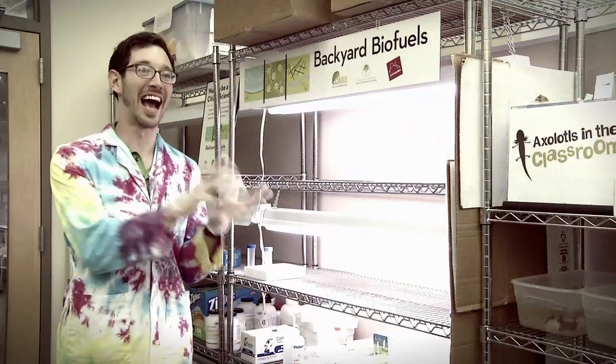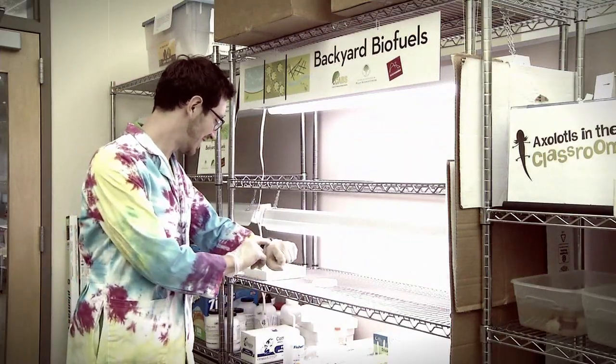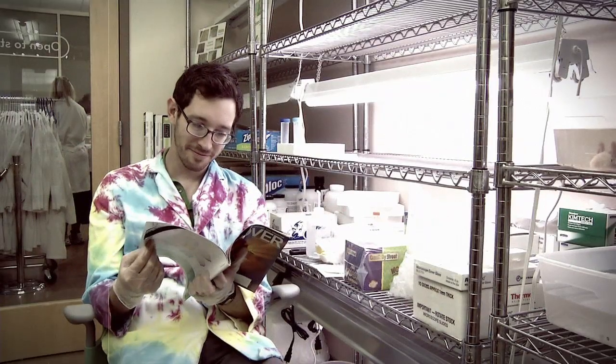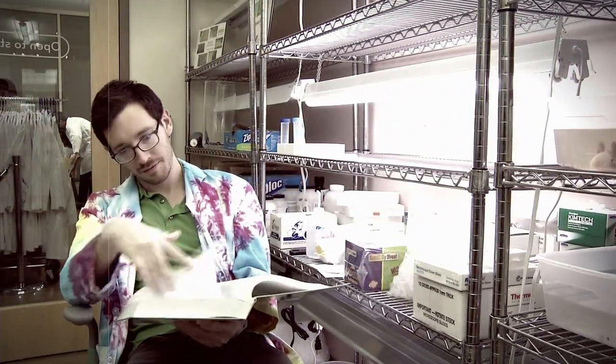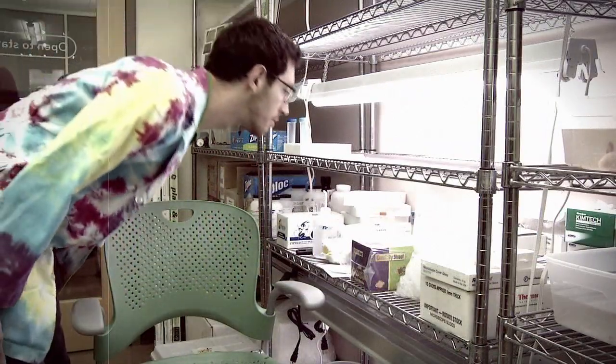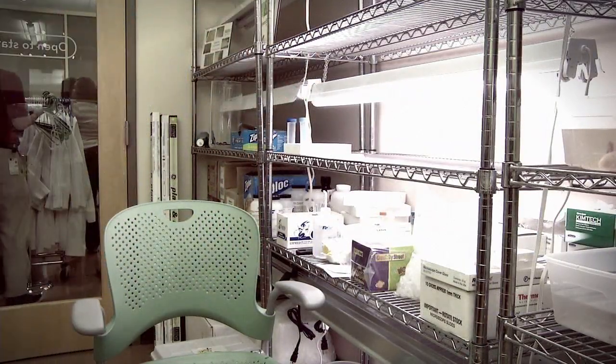Your algae will spend the next few days living under a grow lamp while they populate. Now comes a bit of waiting. This grow lamp mimics sunlight by giving off the correct wavelength for photosynthesis to take place. Since these algae need to make their own food from the sun, they would starve if they did not have a special light like this.